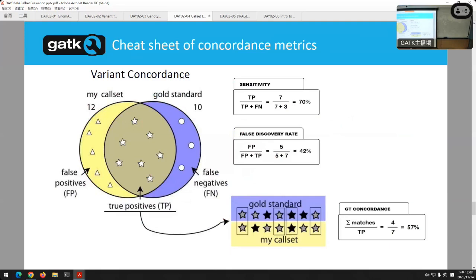And finally, it's not purely about the variants. You want to look at genotypes too, because seeing a variant is one thing. There's a difference between just site quality versus genotype quality. Sometimes it should be hom, sometimes you call them het. We also have a genotype level concordance we can run too. This is what we were running just this morning. We're running the numbers against a couple of control samples, and you get good numbers out of it. You want to see high concordance with known truth sets. If so, you have a lot of confidence that you've done something good in your call set.